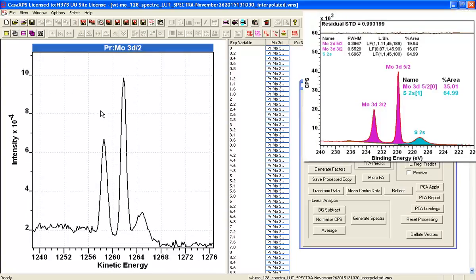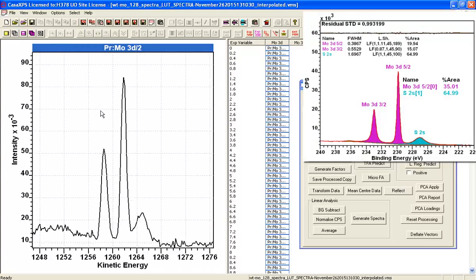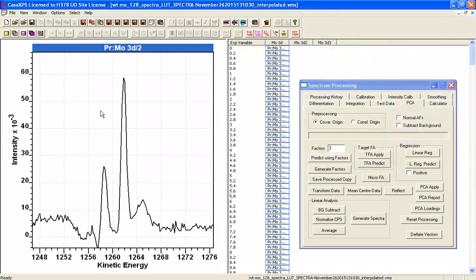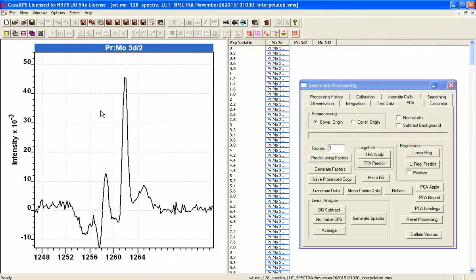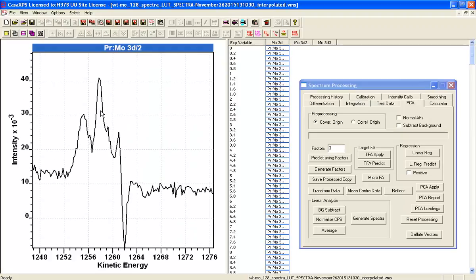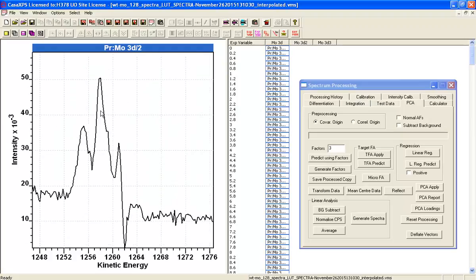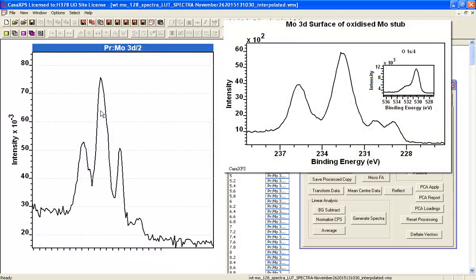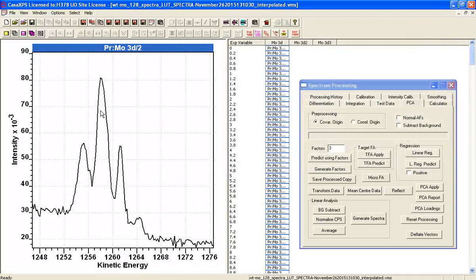And then we'll keep on going down, and you can see that the contribution of the oxygen is starting to go negative. And the idea is that what we're going to find now is a peak shape, an envelope structure that might just give us an alternative perspective of these data.